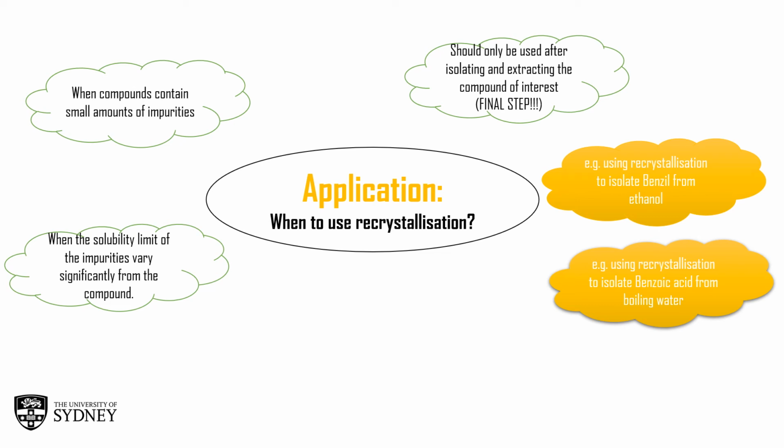We use these properties of solubility and our understanding of solubility limits and the differentials between impurities and the compound of interest in order to achieve a purified sample.